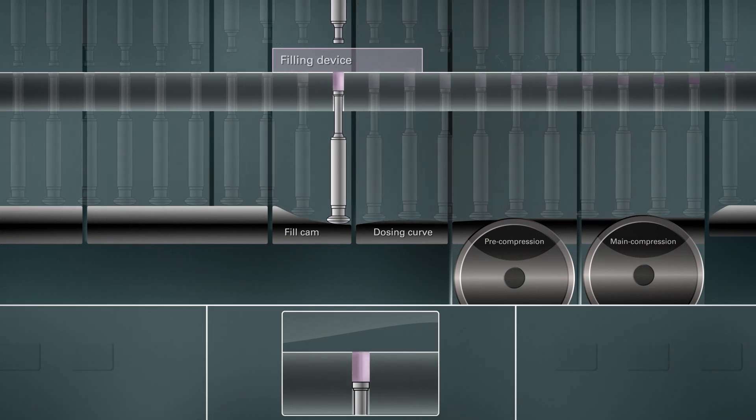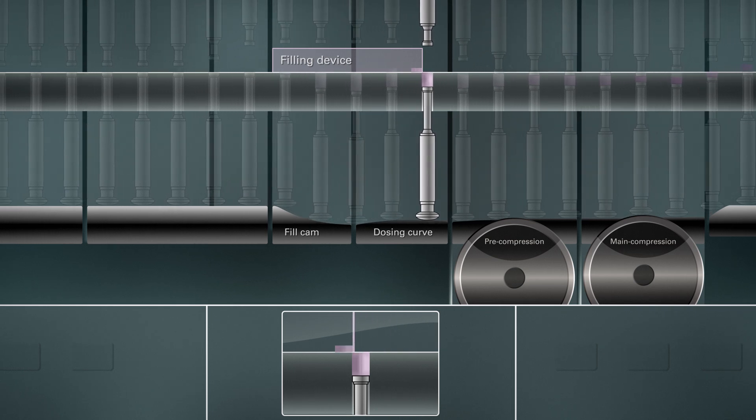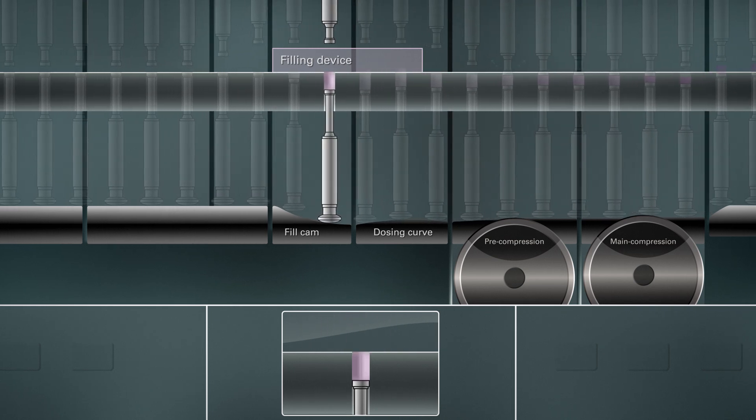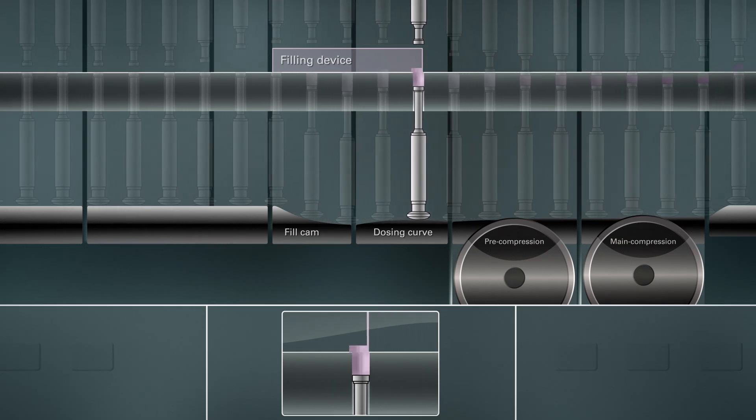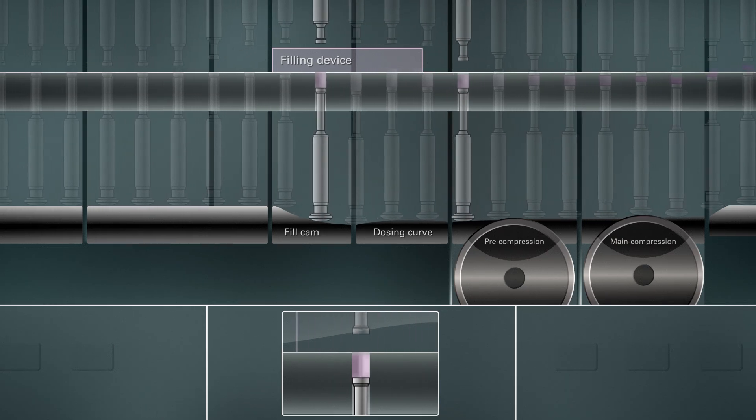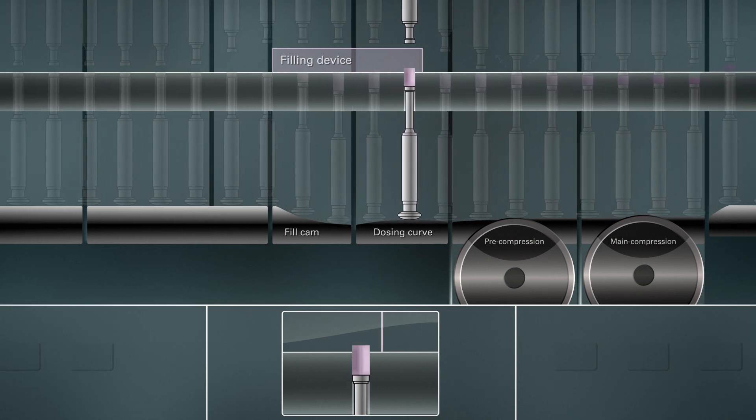The next step is to adjust the material to the correct volume. To do this, the lower punches move up in the dosing cam to adjust the right volume of material. The surplus material remains for further use in the filling device.